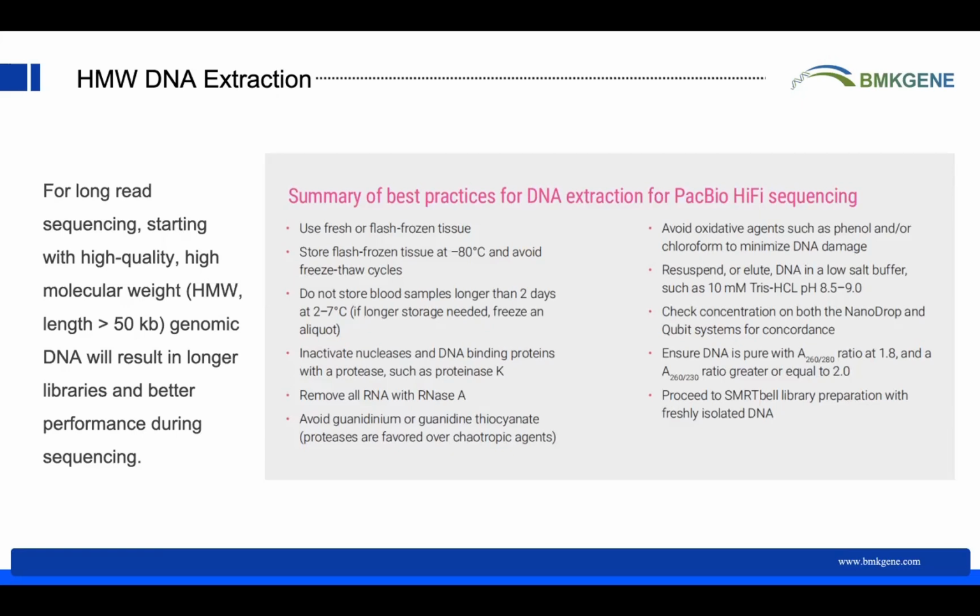And for some other recommendations during the experiment, like removing all the RNA with RNase A and avoiding some substances that affect the DNA extraction. And also you can purchase some related kit to do this.